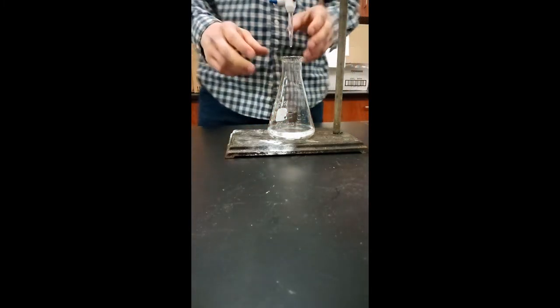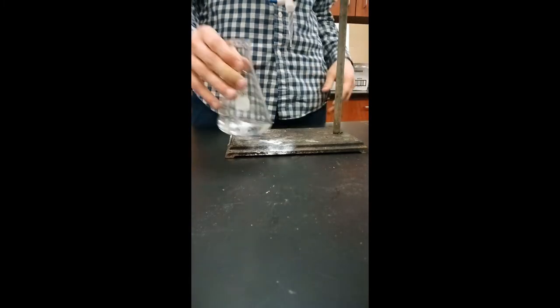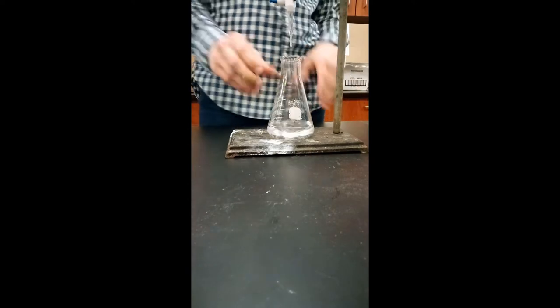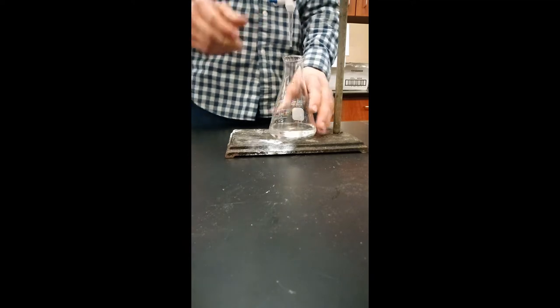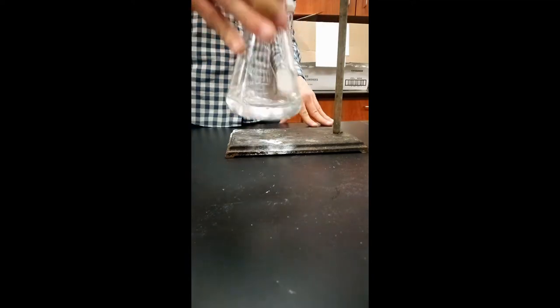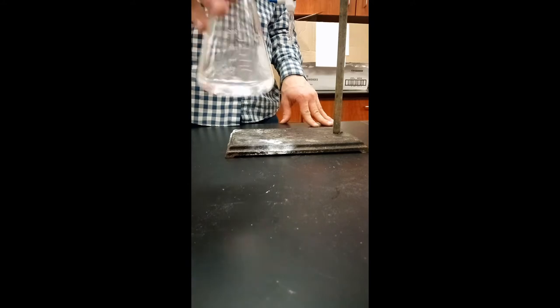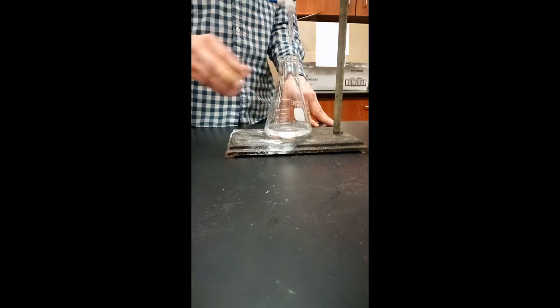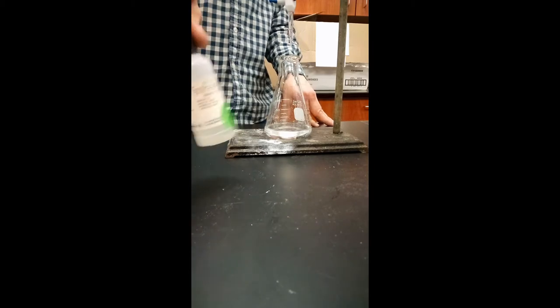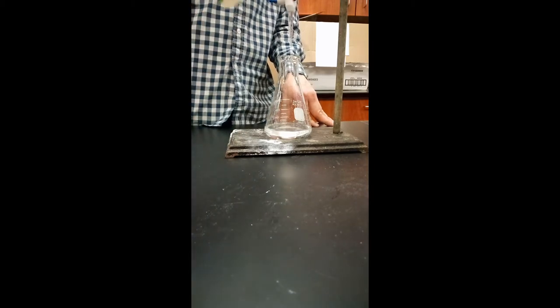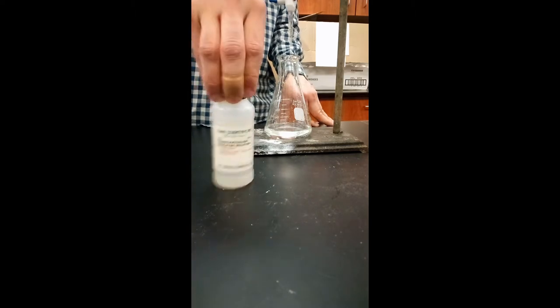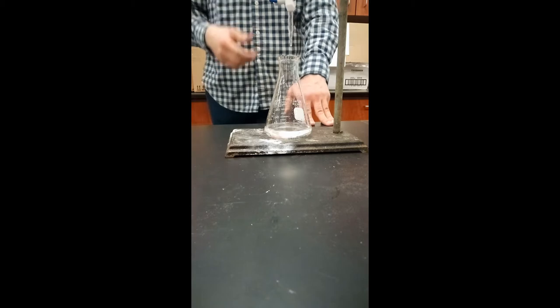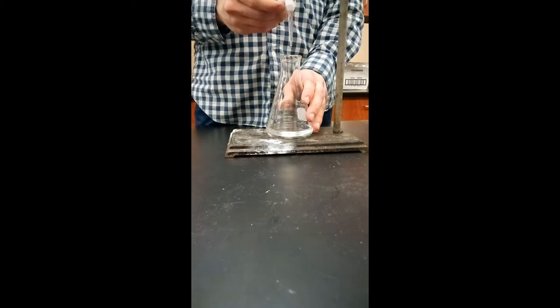We then should be able to take this solution with the phenolphthalein drops in it and add small amounts of the strong base until we see a faint light pink color persist in our Erlenmeyer flask. The color will come because we used the phenolphthalein indicator, so the color will exist once we add the appropriate amount of sodium hydroxide to it.